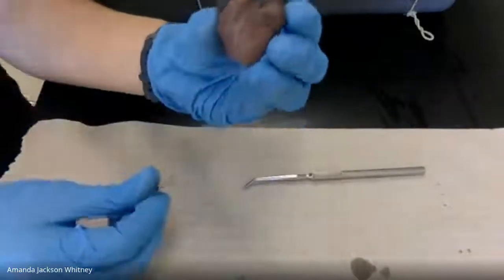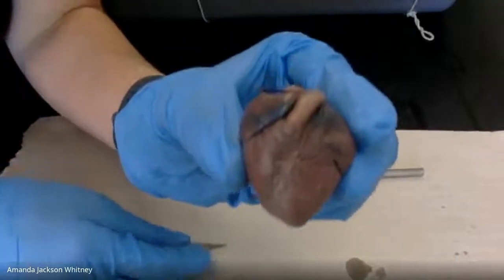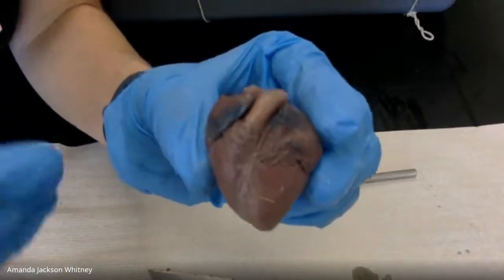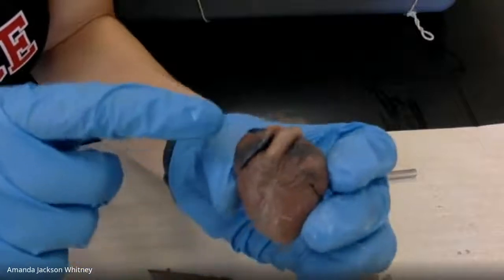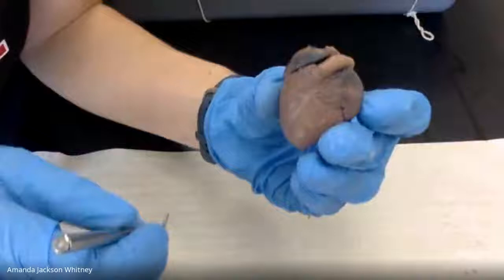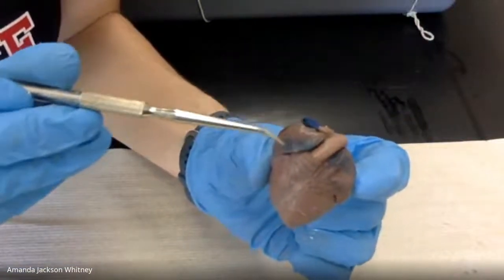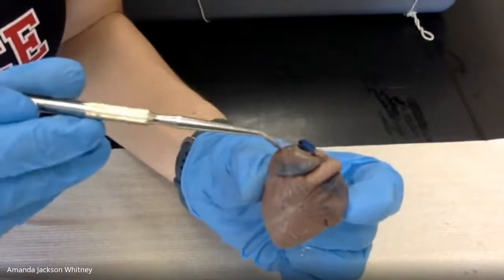So this is the anterior view of the heart. If we're looking at the ventral side of the pig, this is how we would be seeing the heart. We can kind of see the four chambers here. So up here, this is the top, from the pig's perspective, top right chamber of the heart.